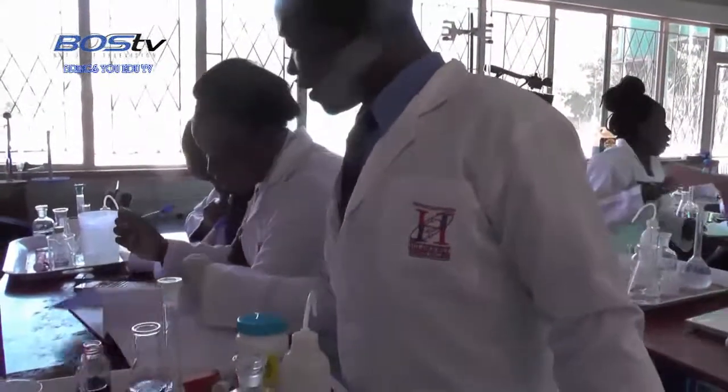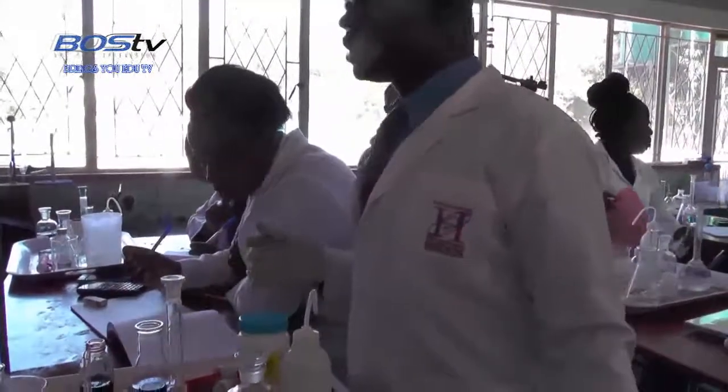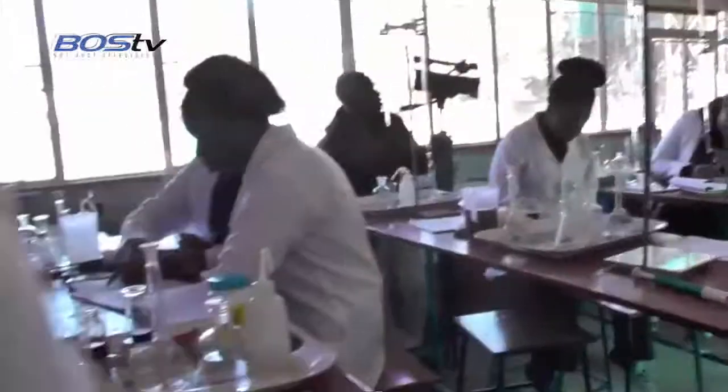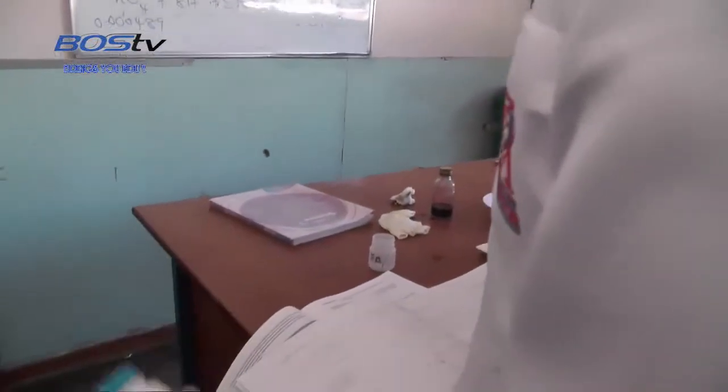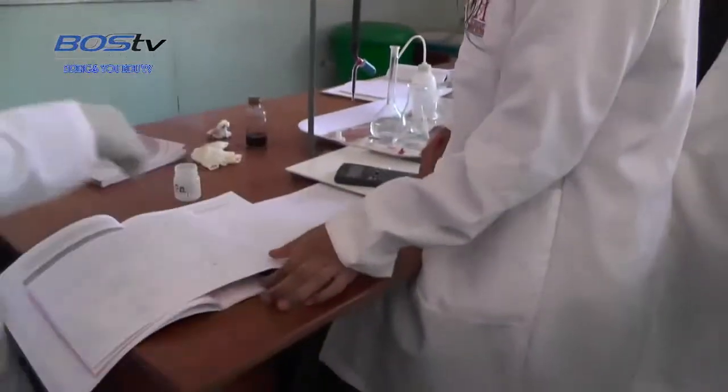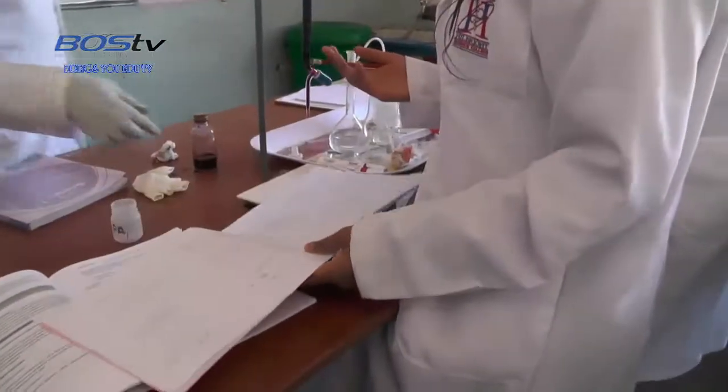Then get an average and then use it in the calculations. Slight deviation from that, but it's fine. Yeah, you can leave it.